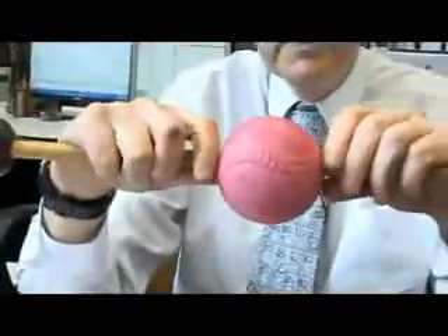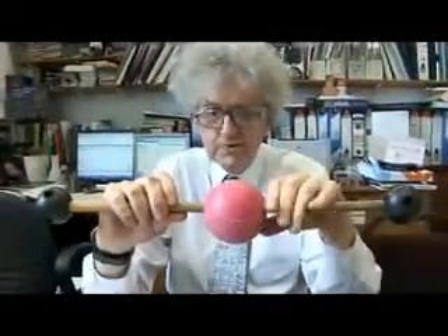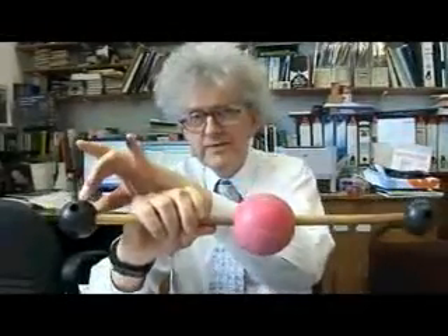In the Barking Dog experiment, you have a mixture of the molecule carbon disulphide, CS2 — it's just like carbon dioxide but with sulphur. This is a large test tube of laughing gas, N2O, and we're going to use that to make some sulphur. CS2 has a carbon in the middle and sulphur at either end, just like CO2 but with sulphur. This molecule, CS2, will react with laughing gas, N2O.